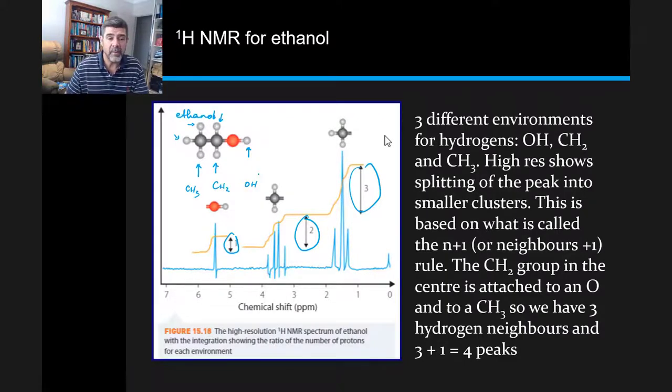When we do that, we're looking for the high-resolution peaks. The high-resolution peaks show splitting into smaller clusters, and this is based on the n plus one or neighbors plus one rule.